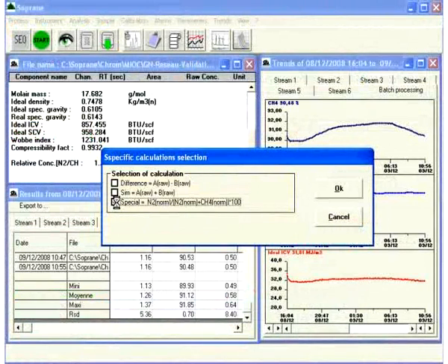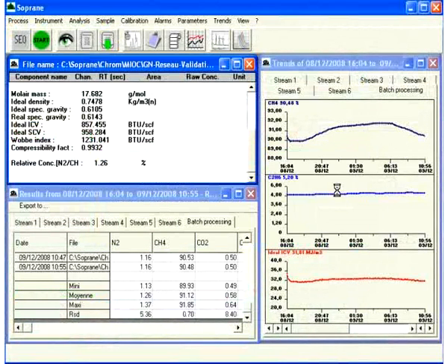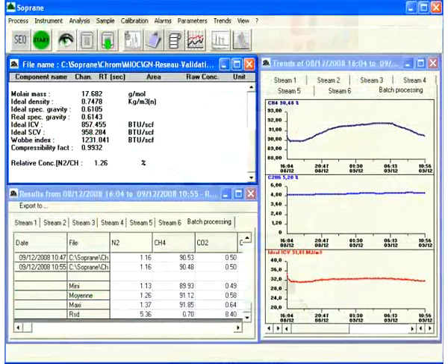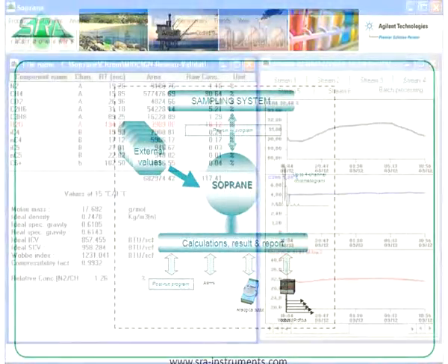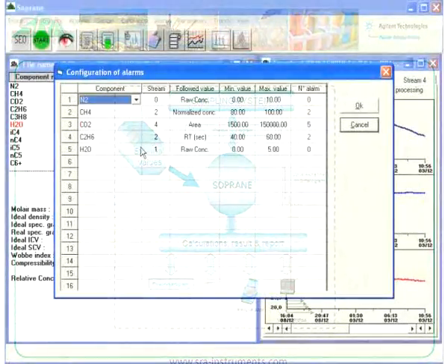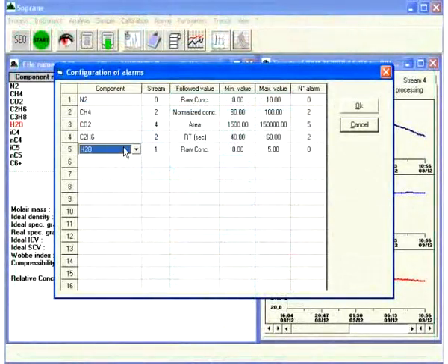Read and integrate other measurements such as temperature, pressure, flow rate or any other analog input signal. These measurement values are also to be integrated into your analysis results reports, graphical trends, statistics tables, etc.